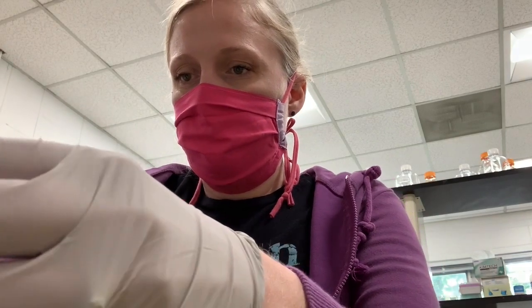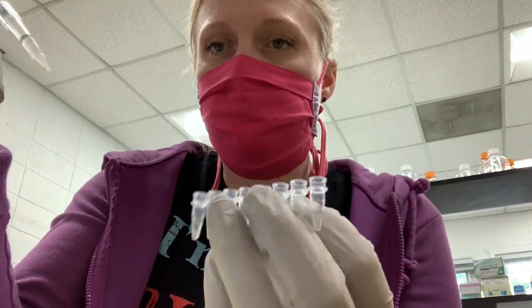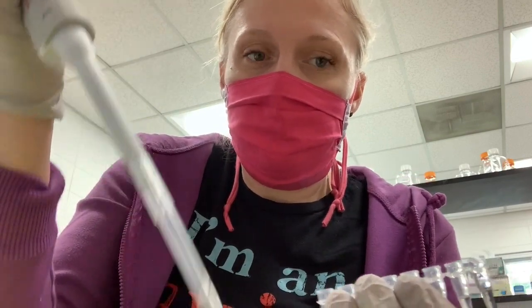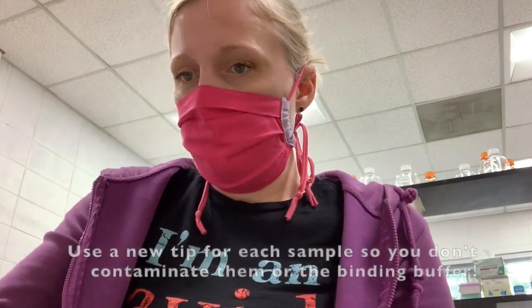So I'm going to pipette up the binding buffer carefully. And then I'm going to take my tubes. I'm going to try to hold this so you can see what I'm doing. I'm going to pipette this into the tube. If I pipetted the whole thing in there, it would overflow. So I'm going to just pipette up and down just once, and then I'm going to move this into my first column. Then I've left some liquid behind. I'm going to come back with the same tip and pipette that into the same column.